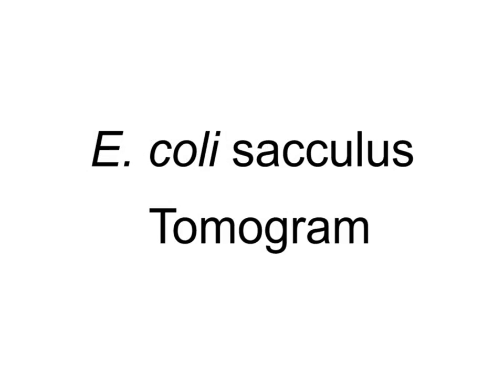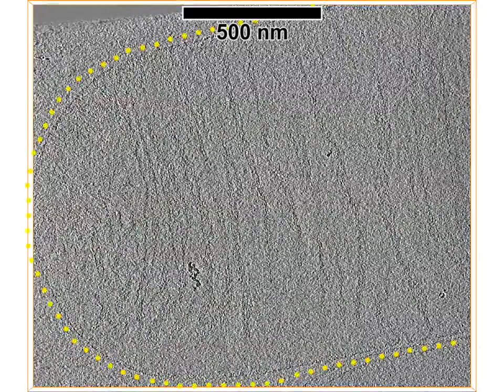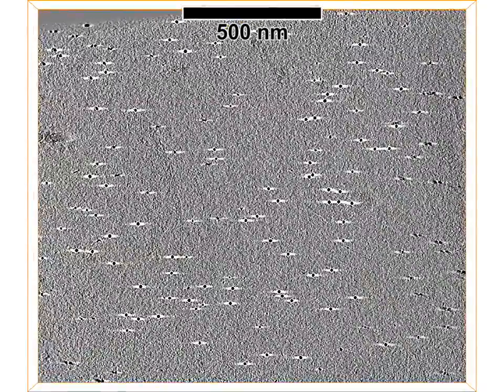This is a slice-by-slice view of the tomogram. The sacculus is outlined by a yellow dotted line. The sacculus is flattened, so it appears wider than an intact cell.